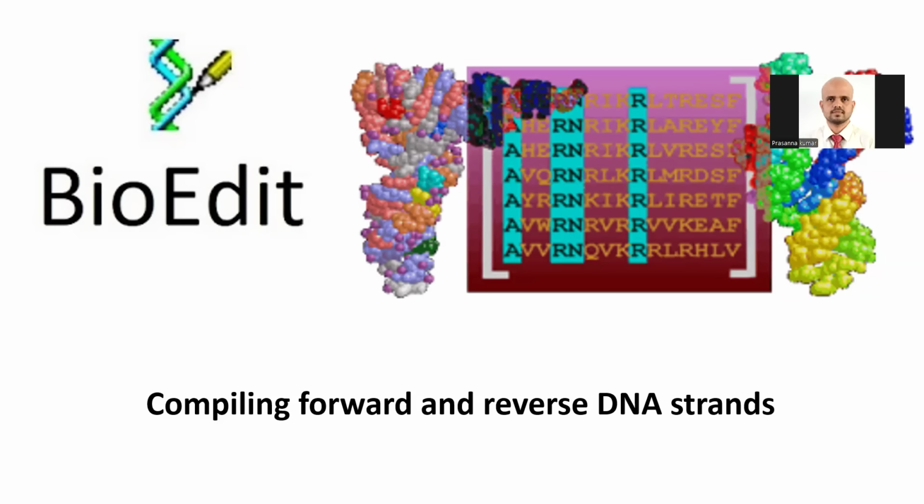So far, we have seen how to use a DNA sequence to find its identity through BLAST analysis, how to construct a phylogram using the DNA sequence and reference sequences taken from the NCBI database, how to study the pairwise distance data, and how to prepare the Excel sheet using colored scale bars. Okay, I hope everyone is clear till now. And before we start our own project, which is today, I want you guys to practice this BioEdit.